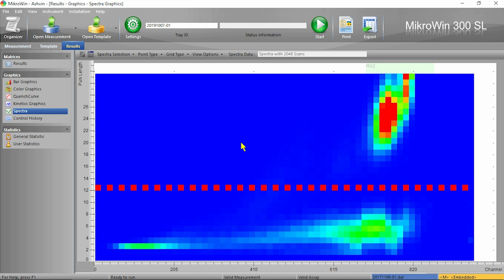If you're using a standard cocktail, the separation will be poorer and the region between the alphas and the betas would be much more narrow, possibly even touching. If this were the case, you would have to lower the PLI to around 7 or 8 so it's at the top of the beta region.